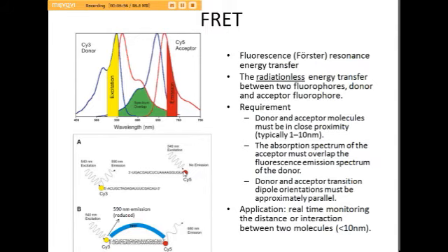Now if we shine 540 nanometer excitation light, Cy3 is going to be excited to generate emission light. Here 540 nanometer is around here, and its emission will be roughly here, 590 nanometer. Cy5 will also be shined by the 540 nanometer excitation light.